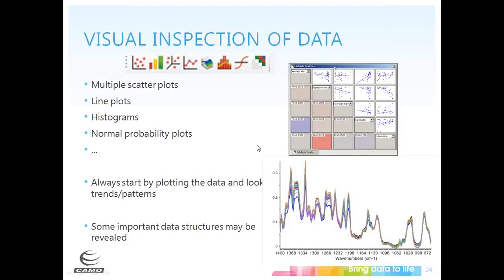After importing data, it's important to visually inspect it. The Unscrambler X provides many plot types including multiple scatter plots, normal probability plots, histograms, matrix plots, line plots, and scatter and bar plots. It's always a good idea to start by plotting your data and looking for trends and patterns — some important data structures may be revealed, as well as errors or anomalies. Always visualize your data before you analyze it.